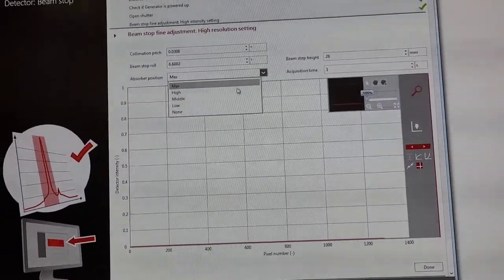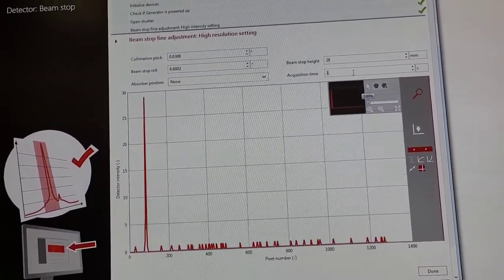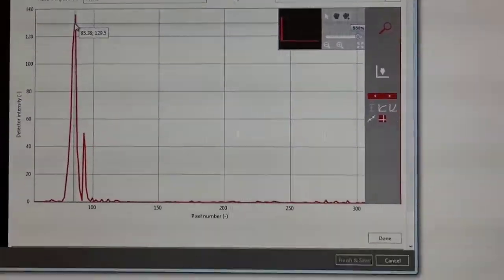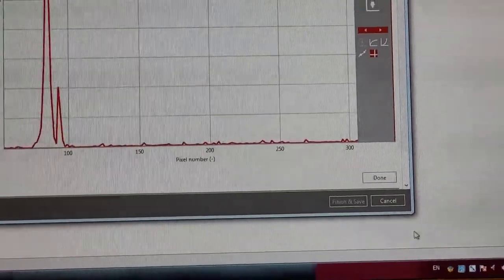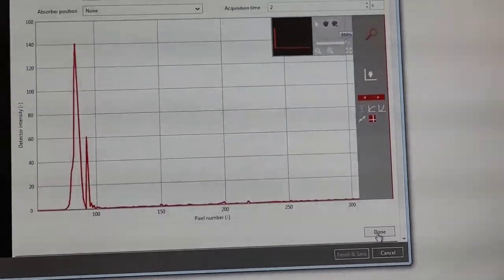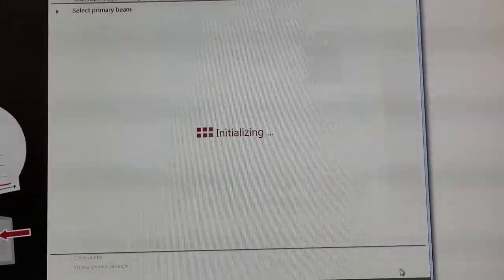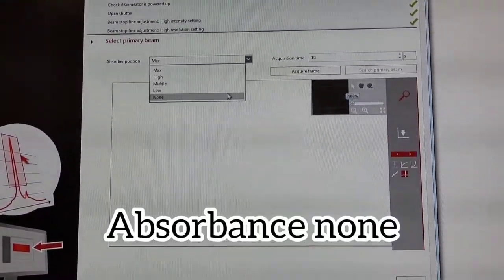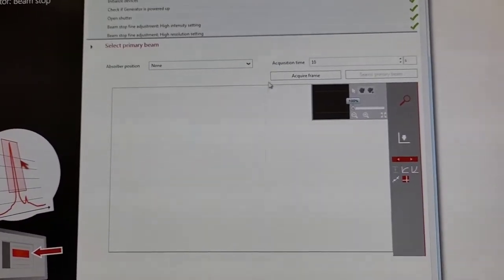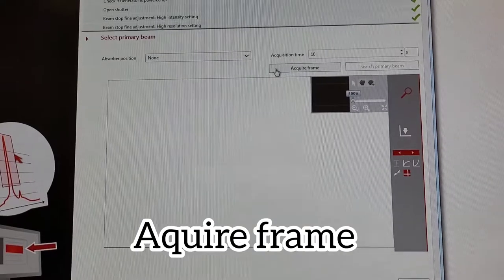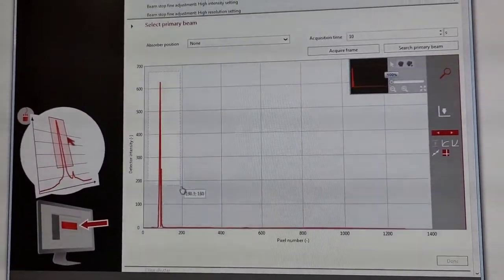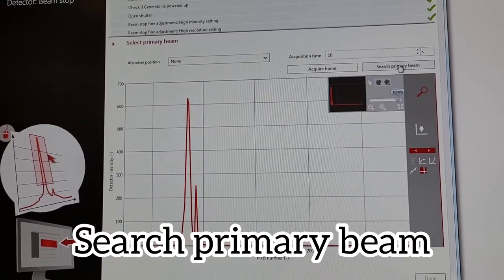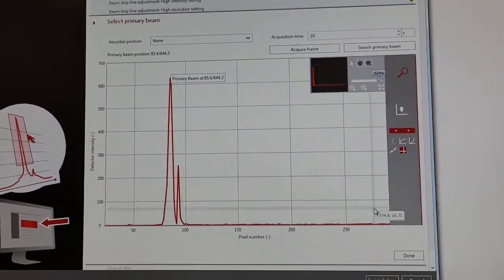The secondary beam should be about a third as high. Here I'm repeating the same thing. Absorbents at none, the acquisition time at 2 seconds, and the adjustment was about a third. Then finally you want to do this step where you search for the primary beam. And that's about it for the beam stop alignment.